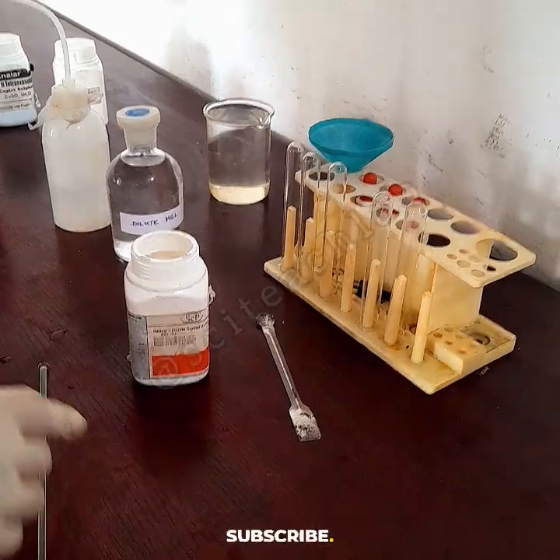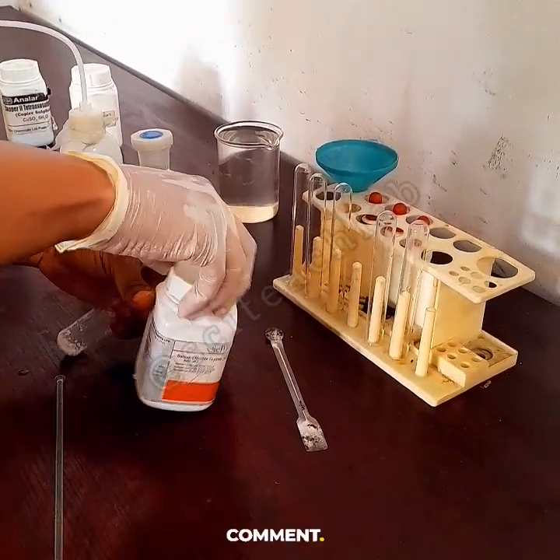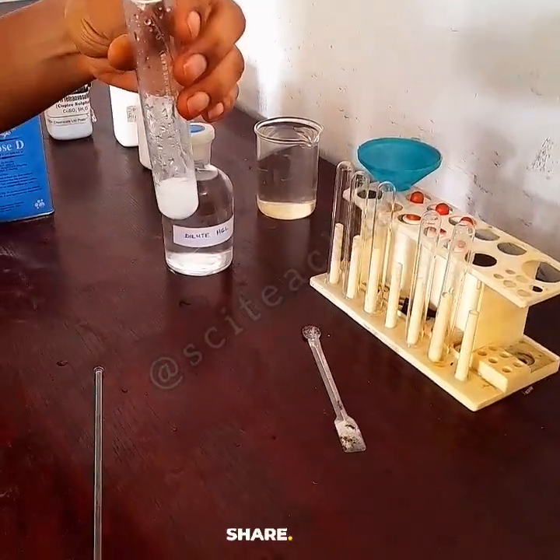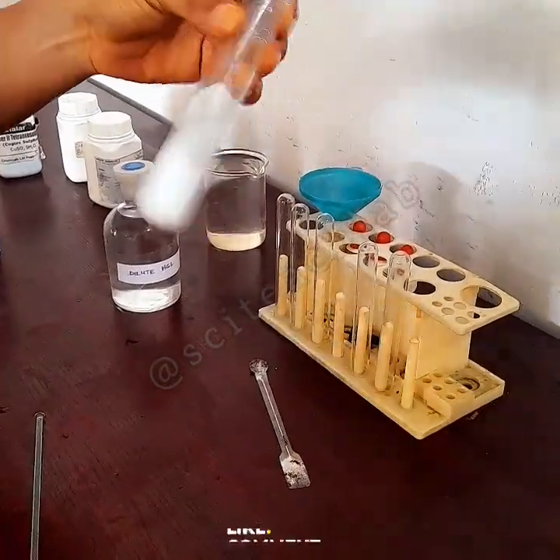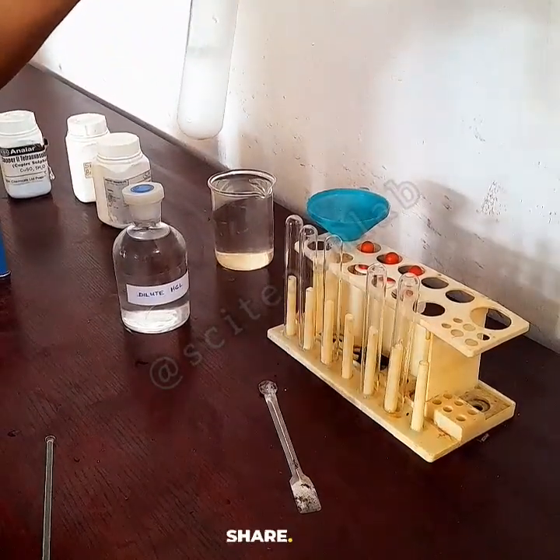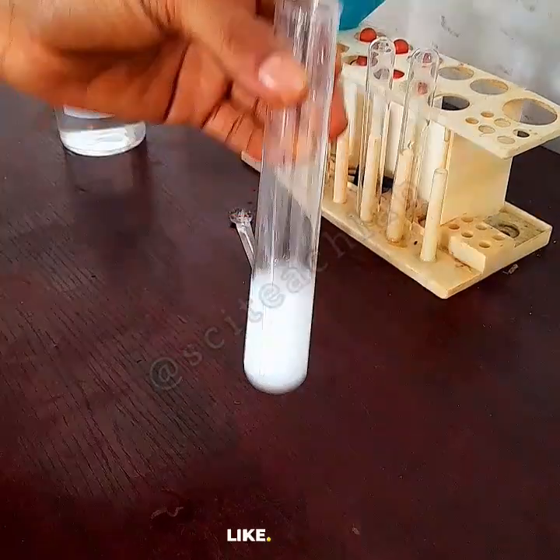A little amount is okay, even the tiniest amount contains the barium chloride. We dissolve it because we are going to use it to test for the negative ion contained in that salt. All right, so I have my aqueous barium chloride solution ready for the test.